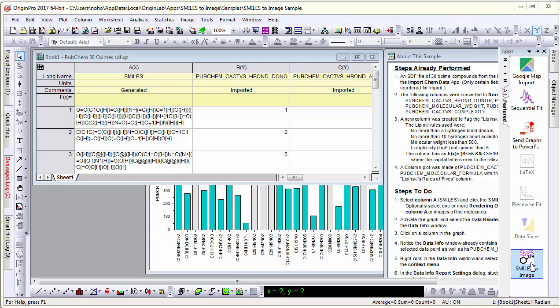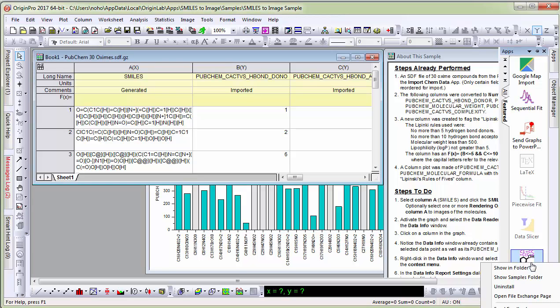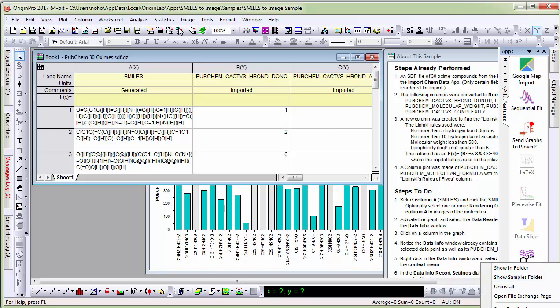I have a project open that is shipped with the app, a sample project. You can access it by right clicking on the app icon and selecting show sample folder.